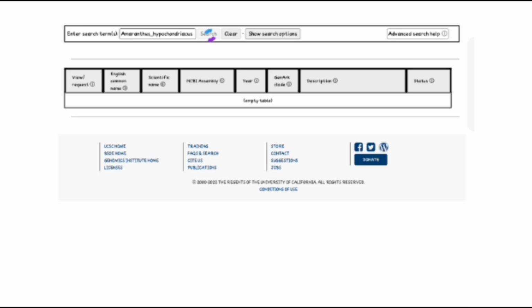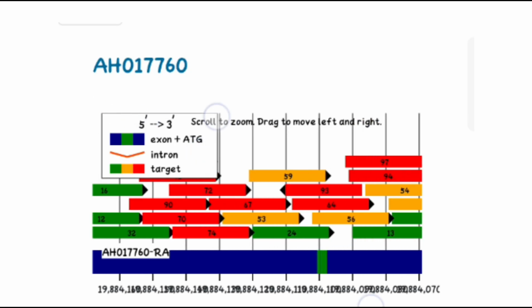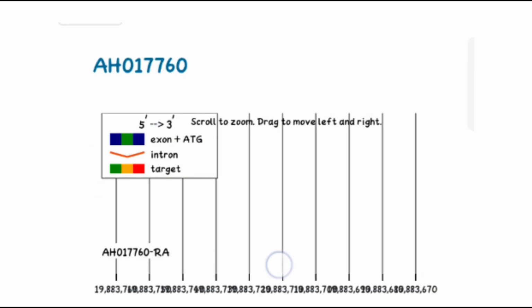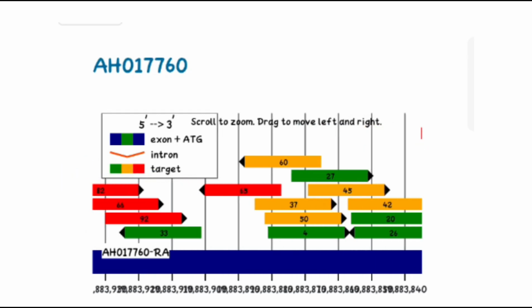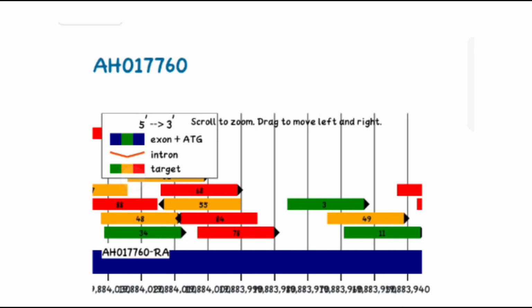Here we can also request for genome assembly, search, and we can drag to move left and right and scroll it.